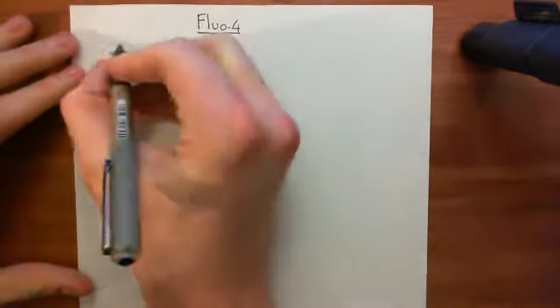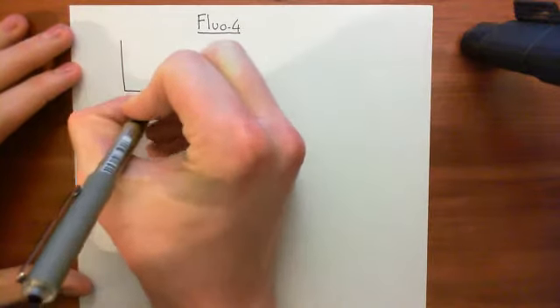Okay, and what's special about Fluo-4 is that you can actually use it to measure the calcium concentration within cells. We'll come to how we can use it to measure the calcium concentration within cells right at the end. We will for now keep it nice and simple and think about just trying to measure the concentration of calcium within some beaker, okay, within some solution in some beaker. Okay, so we've got some beaker here.